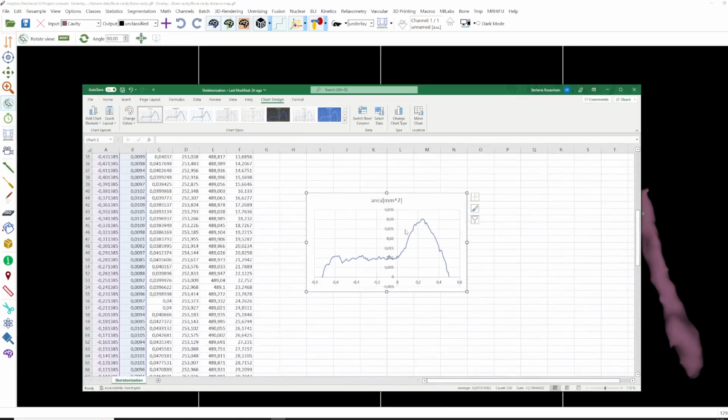This is the area in square millimeters along the class. You can see here that it gets bigger and it's a larger area. When you shift the column to this, you can also see the sphere radius, and it's a similar readout, but it's in millimeters in this case.